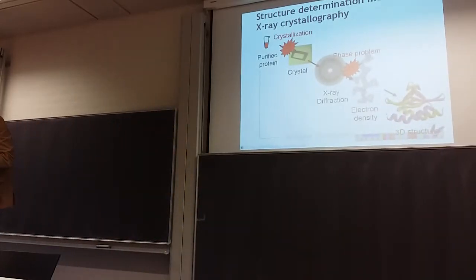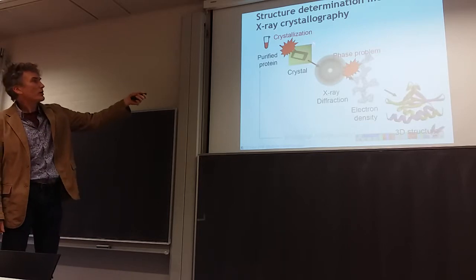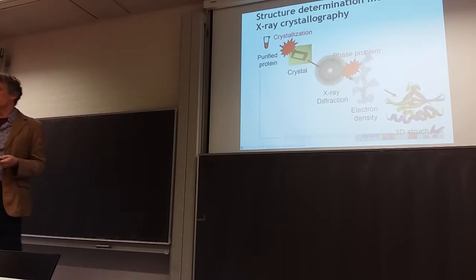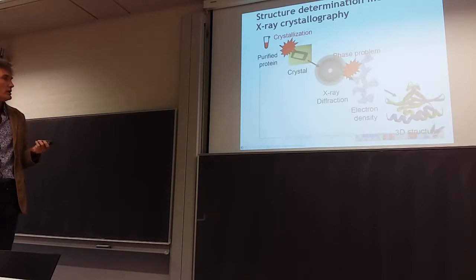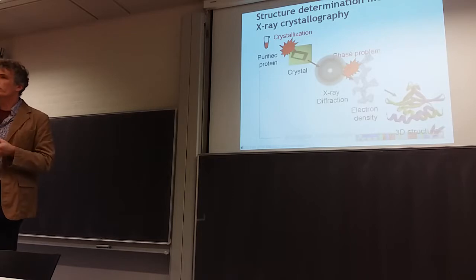Okay. So now, what do protein crystals look like? Well, under a microscope, they look like this. If you're lucky, they're like 2-3 millimeters big. The bigger the better, because you get more signal out of them. But inside, how do you build a crystal out of proteins?